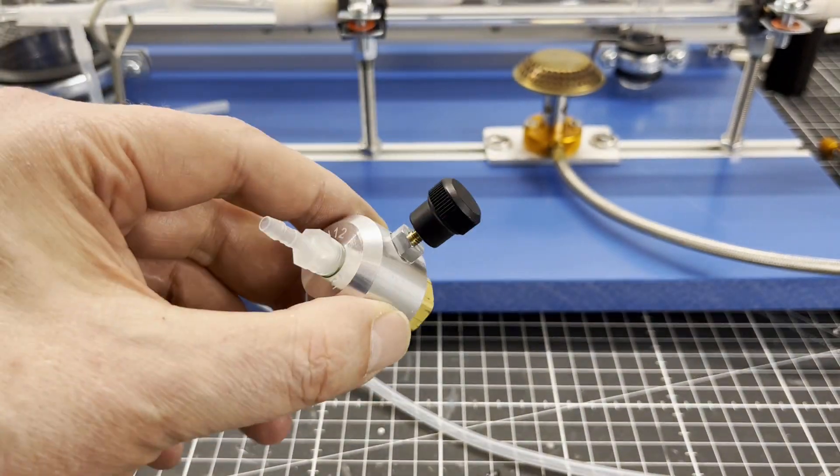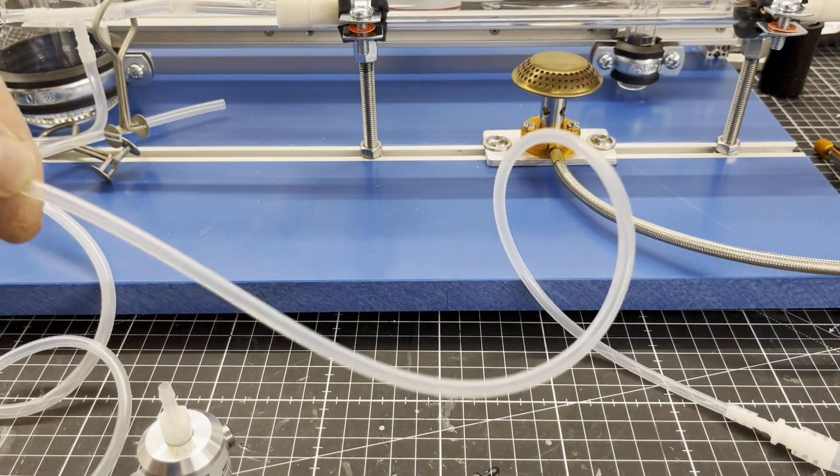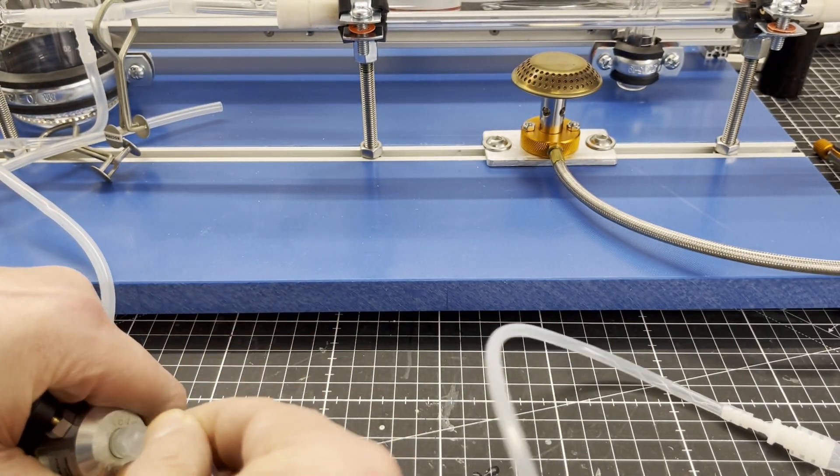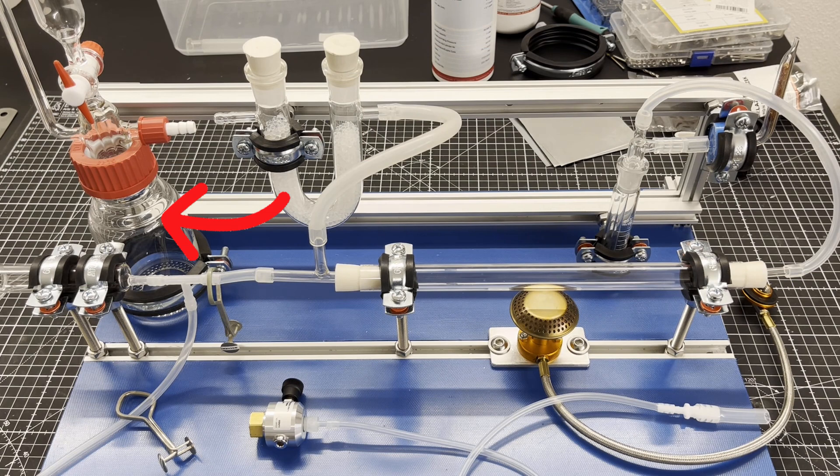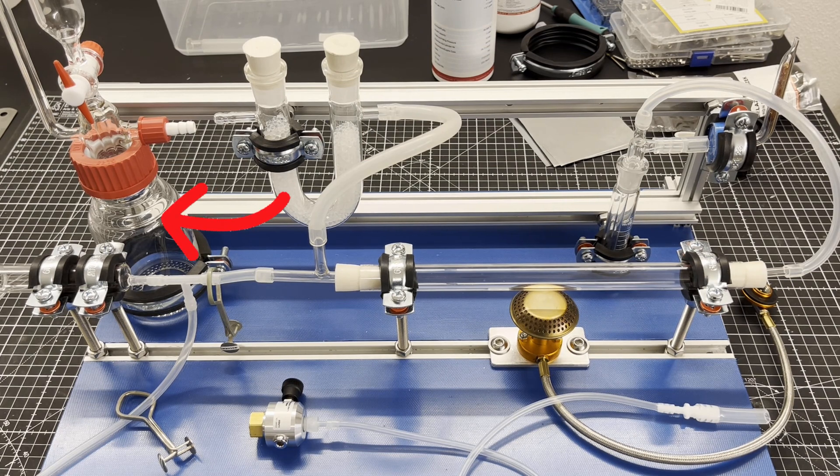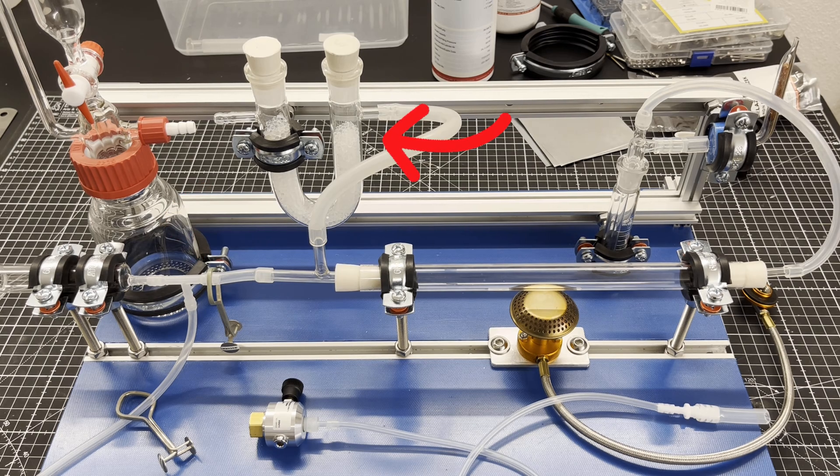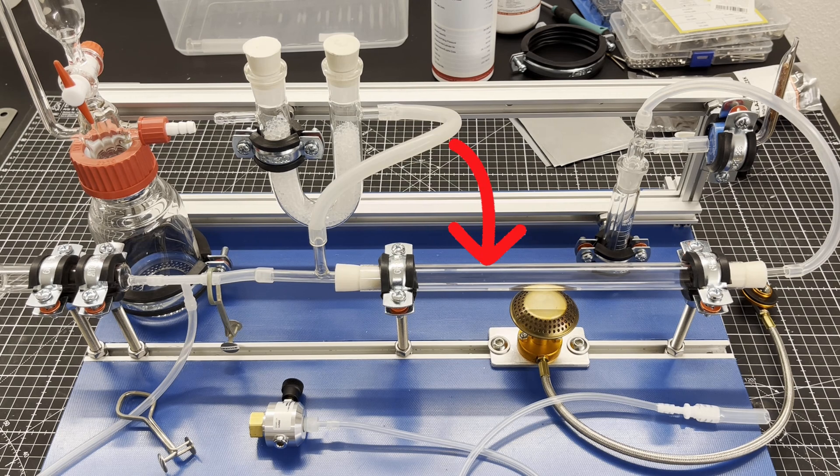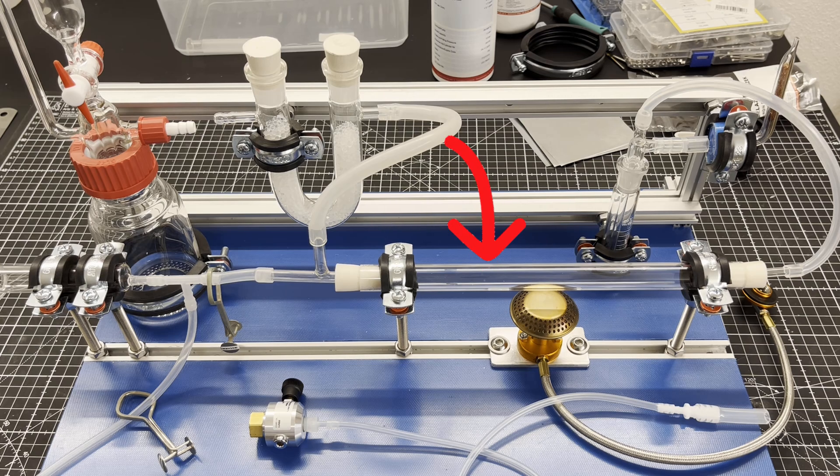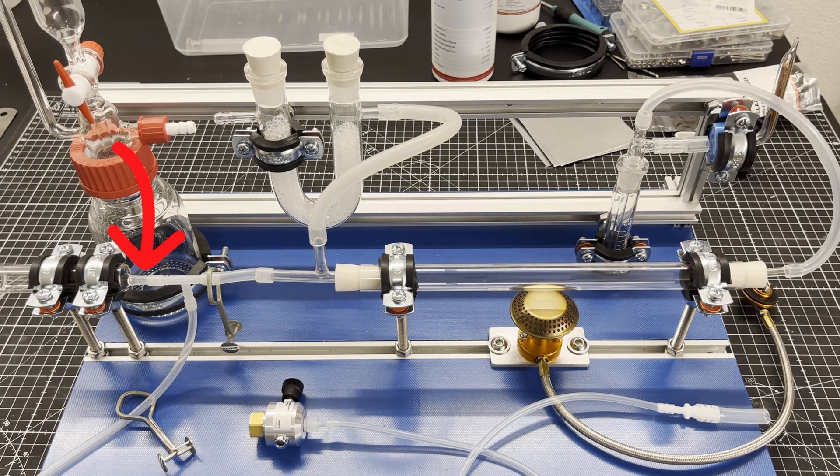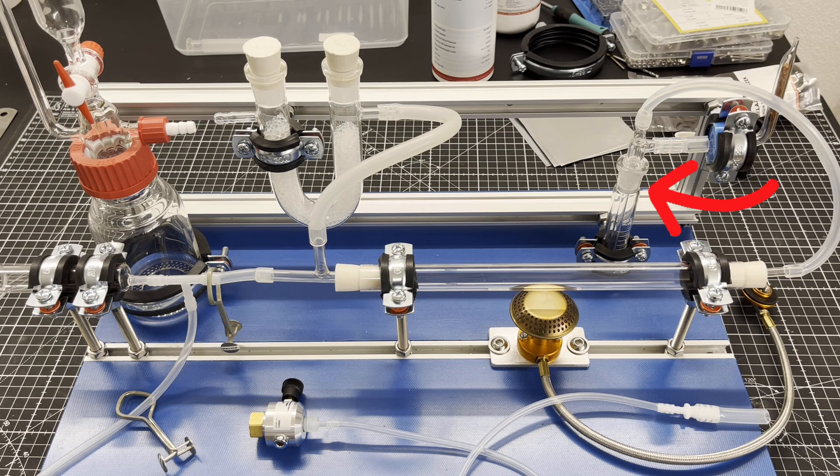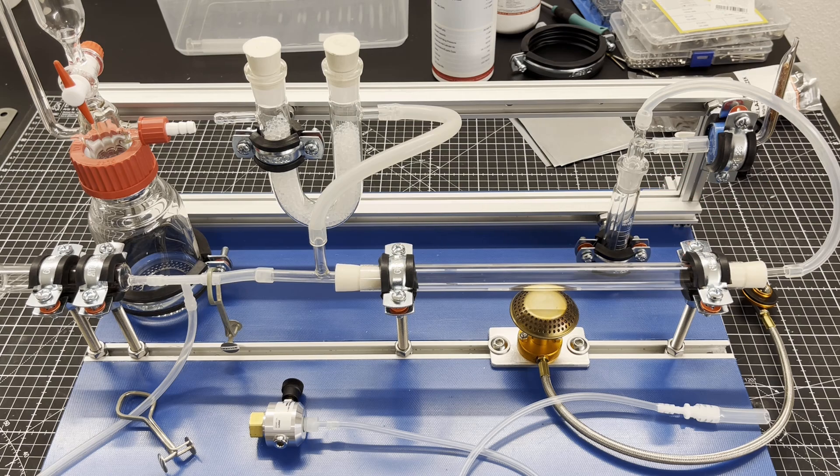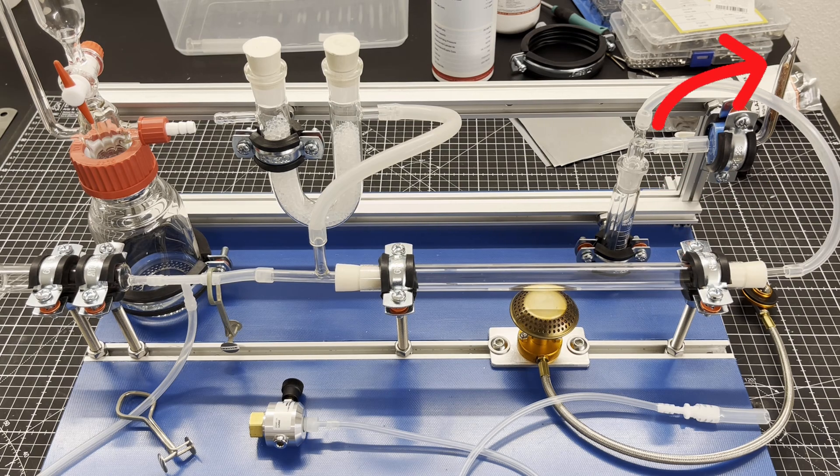Let me now explain the apparatus. That is a gas generator that supplies the necessary hydrogen. The hydrogen is fed through a drying tube. The dried hydrogen is then passed through the quartz tube. The catalyst will be later located in the tube and will be strongly heated together with the gases. Pure nitrogen is supplied in portions via the gas syringe. The synthesized ammonia is passed through a gas washing bottle, which will later contain a detection reagent. The excess hydrogen is finally ignited at the flame tube.